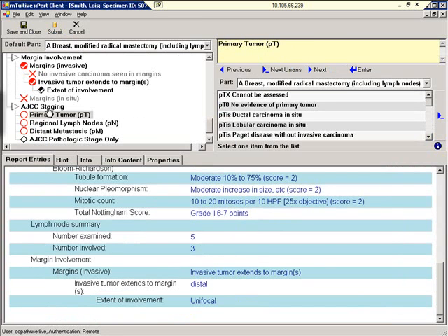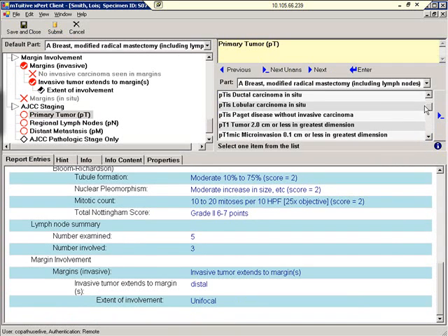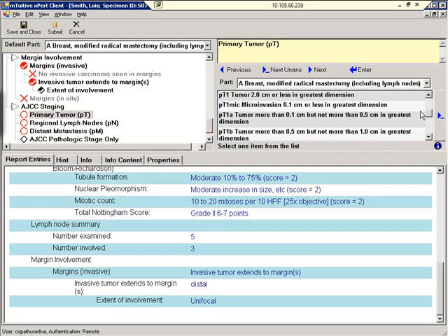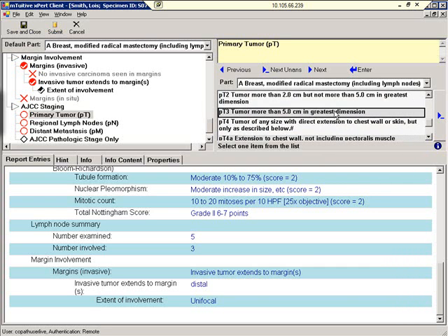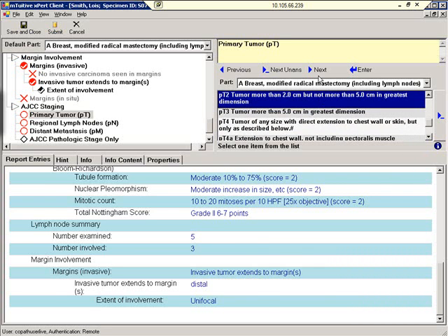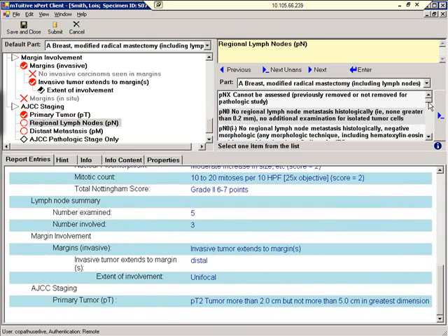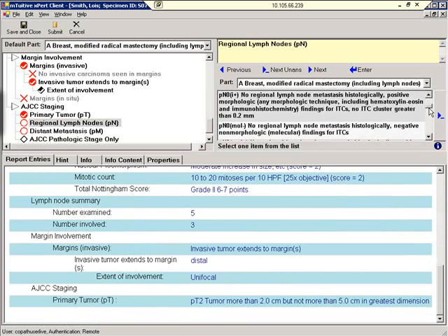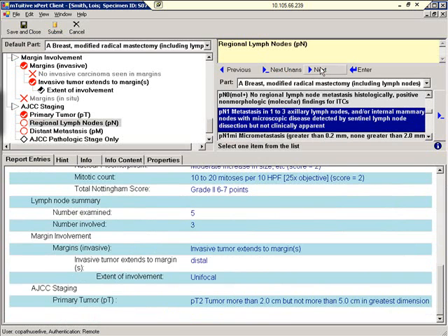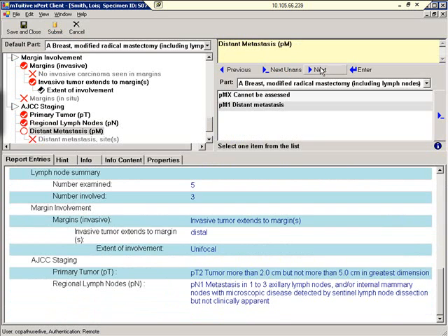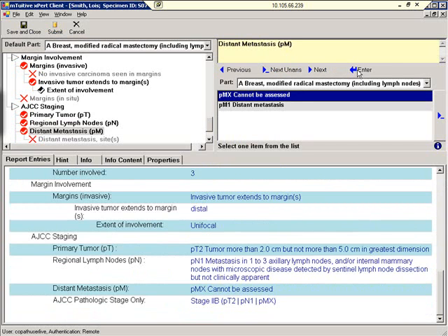We've arrived at the AJCC staging area where we can stage the tumor. Primary Tumor. We'll select PT2. Click Next. Regional Lymph Nodes. PN1. Distant Metastasis. We'll say that metastasis cannot be assessed. We'll click Enter. And as you can see, the AJCC pathologic stage has been derived for us.